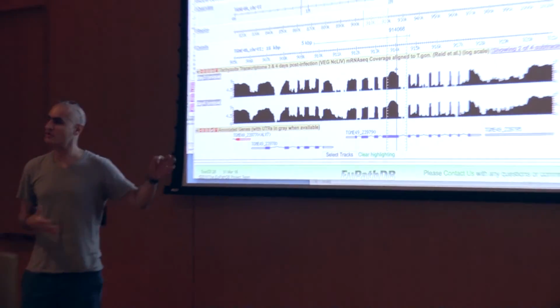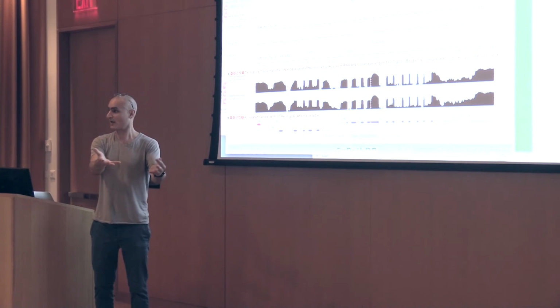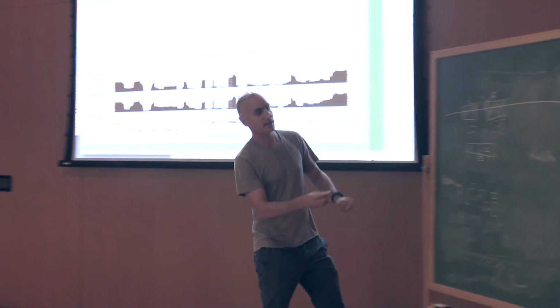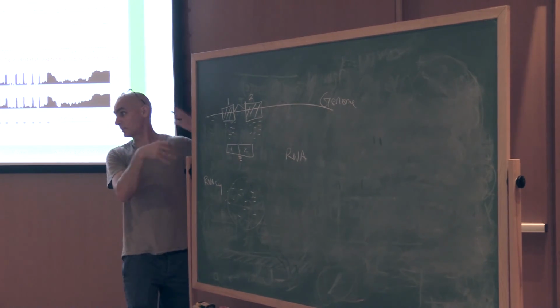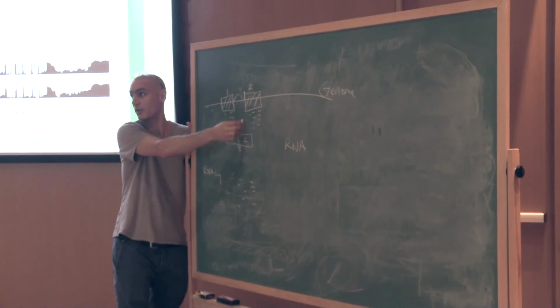Which makes sense. If this gene is being transcribed into RNA, and you sampled this RNA, then when you map all the little fragments back, you're not going to get mapping elsewhere. You may get some mapping here randomly, or maybe there's some undiscovered gene, because you can discover new genes. But most of the mapping will be to the exons.